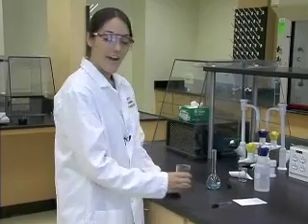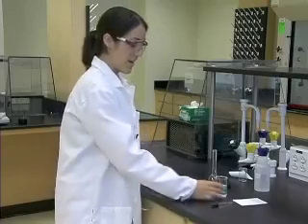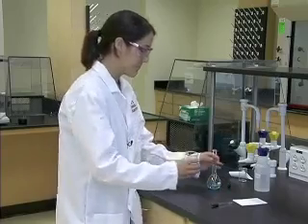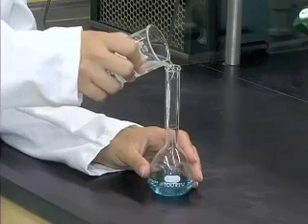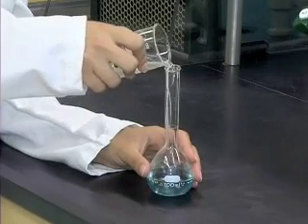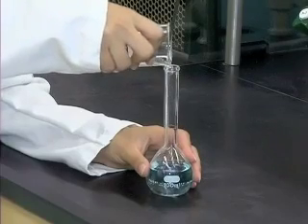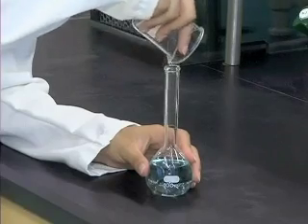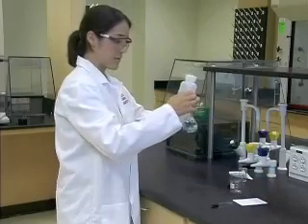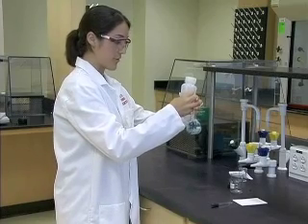We will now add water to our volumetric flask. It is much easier to add from a beaker. You want to add it to the point where the bulb meets the neck. We do this because sometimes when you add liquid to a solid it can expand, so you want to ensure that you don't overshoot your mark.